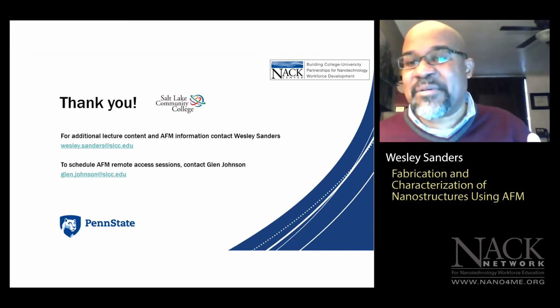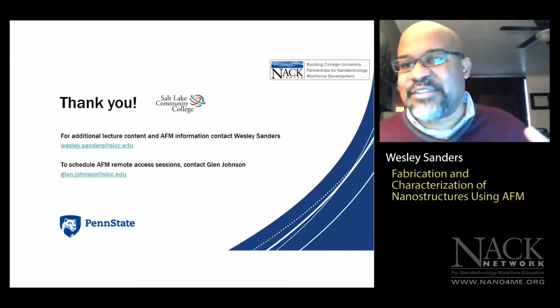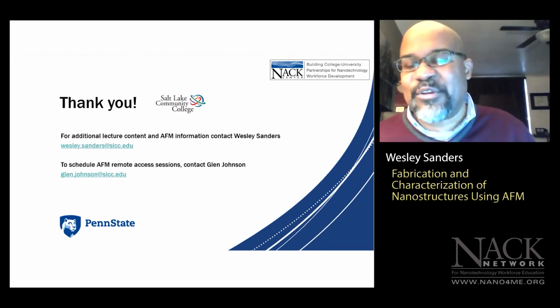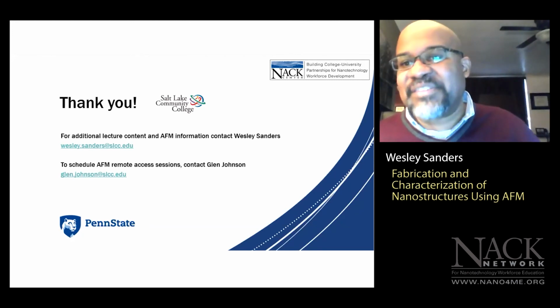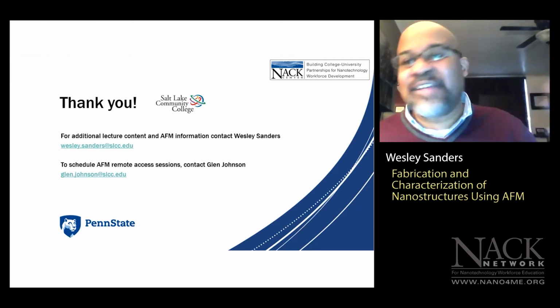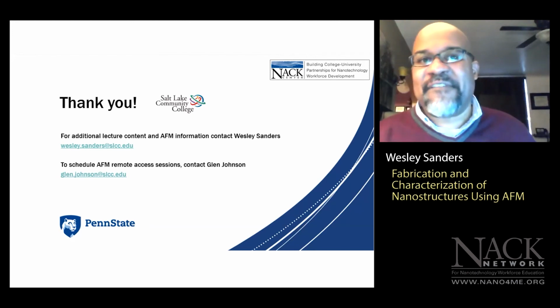So in the case of superconductors, if you're interested in studying their magnetic properties, then yes, there's a flavor of AFM that will allow you to do that. But that's something that we don't do. There may be some other superconducting applications applied to AFM. I just don't know any off the top of my head. Thanks.